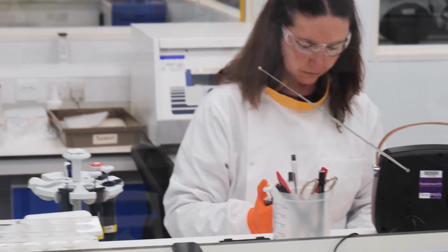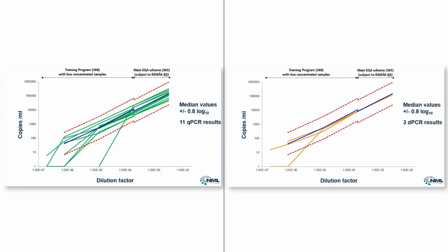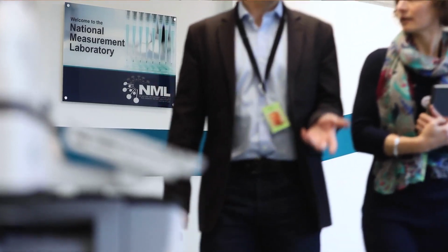Digital PCR is like a digital radio. It gives you the results, bang, there they are. It counts the individual molecules. You're no longer dependent on an amplification curve that you require on qPCR to give you the actual signal of what you're measuring. Digital PCR is able to do that because of the partitioning that occurs that essentially gives the individual molecules their own individual PCR reaction, and it has much greater sensitivity.